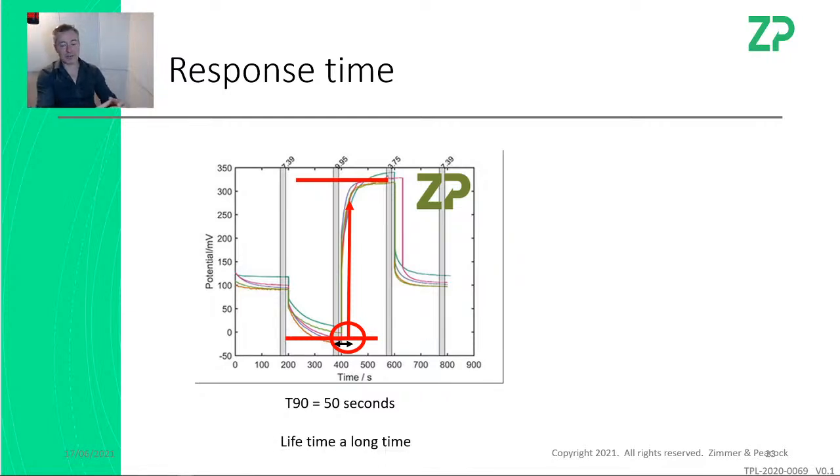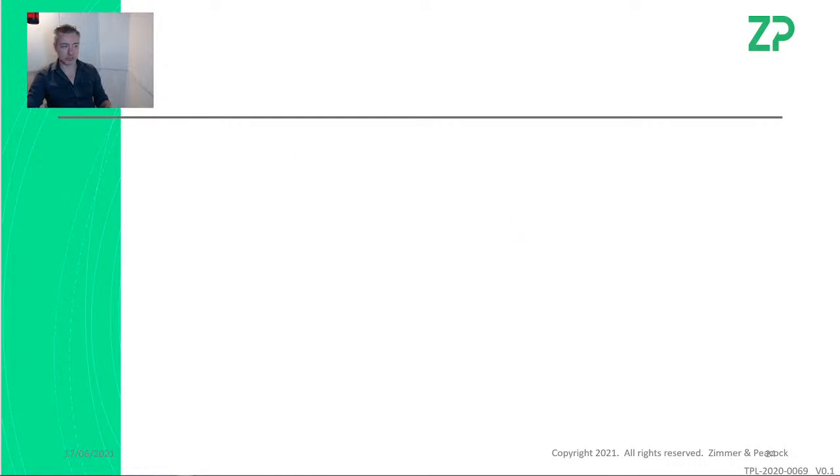The lifetime, it's a hard one. When somebody asks you what's the lifetime, glucose sensors have a really good lifetime. And the pH sensors have a really good lifetime. The sensor that has the worst lifetime is actually the lactate sensor, because the enzyme is so wimpy. But at least the pH sensor, the nitrate sensor, we stick it in the soil for 3 months, it's still working. So many of our sensors are fairly robust, but unfortunately you have to try them in the application.